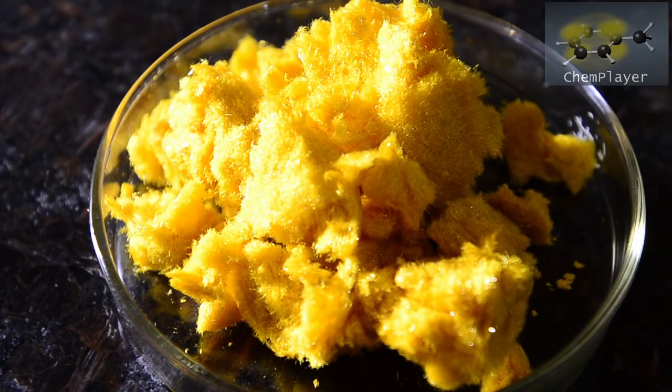we're going to keep our product very dry and store it in the fridge until we find a future use for it. Stay tuned for more videos.